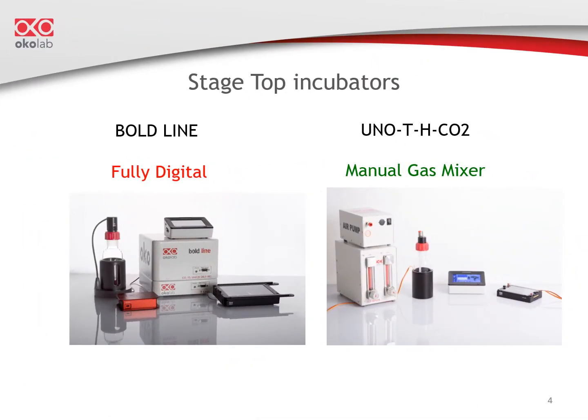This slide shows you the two Okolab offerings for stage-top incubators. On the left, what we call Bold Line. On the right, what we call UNO THCO2, T for temperature, H for humidity. Let's see them in more detail.